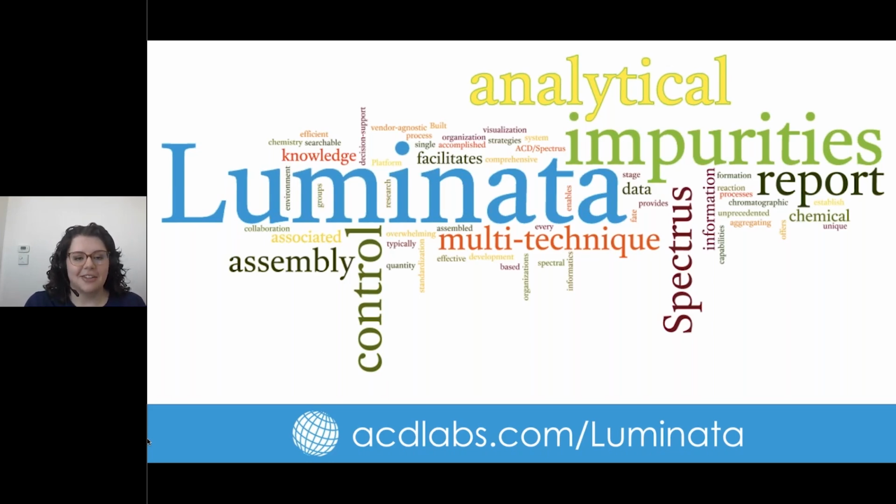Okay. All right. I think we have time for one more really quick question. Someone asked, does this software, I assume that's Luminata, help in predicting the correct structure of an impurity when MS and carbon and proton NMR data input is given?